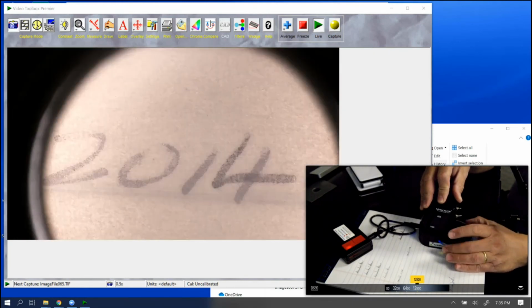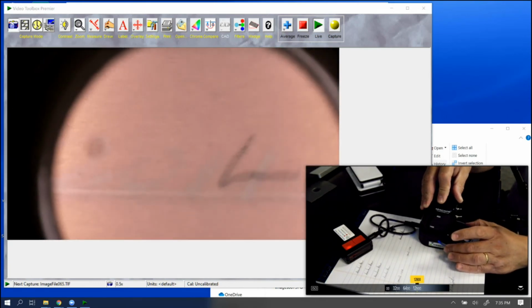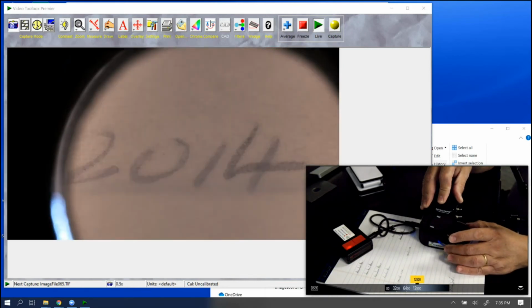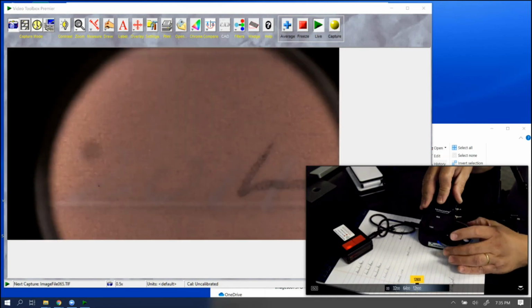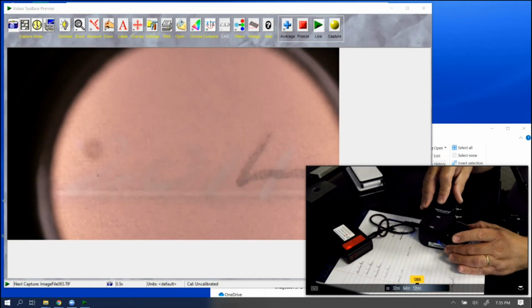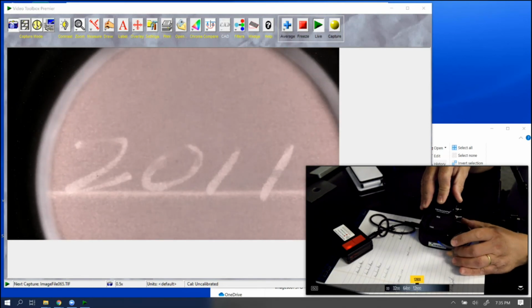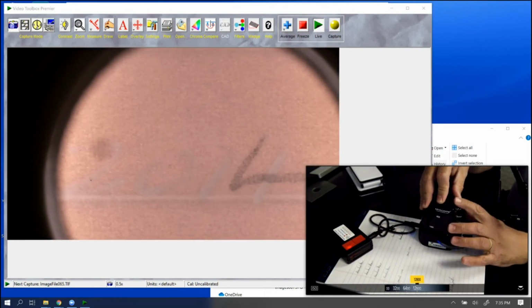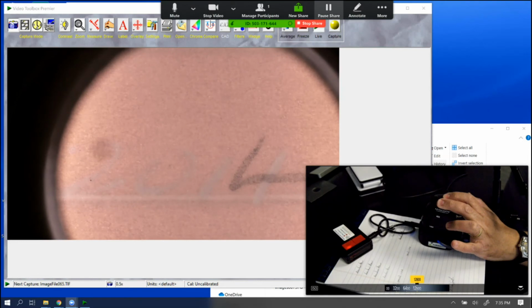Here, what we're going to do now is start to flip through with our different filters. And in fact, what you can see here is as we cross over now into a different band, we can see here we have almost no luminescence in the part of the 4.